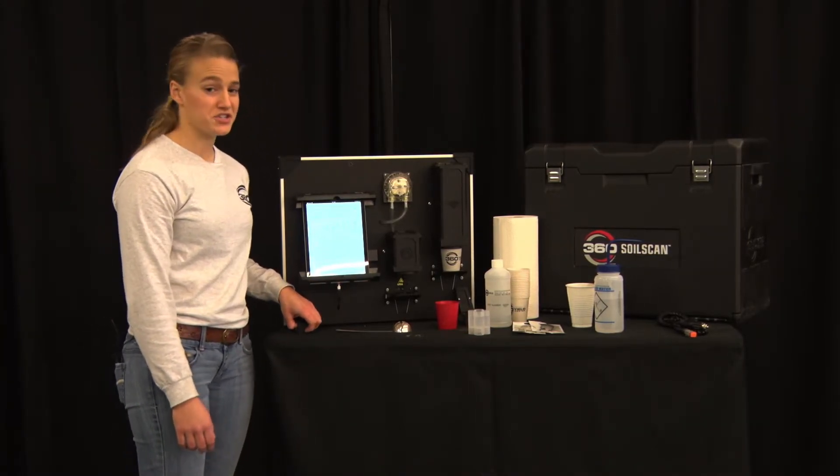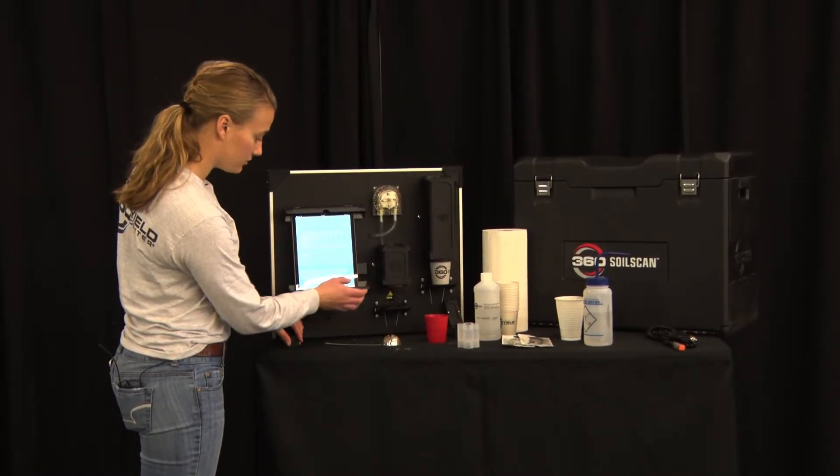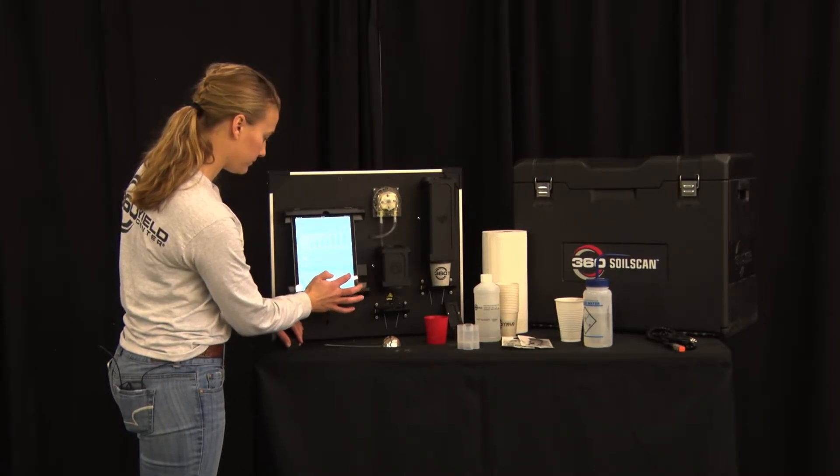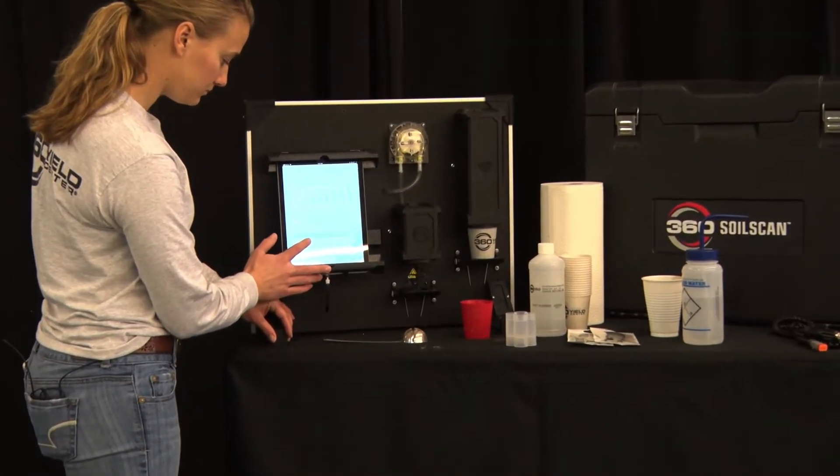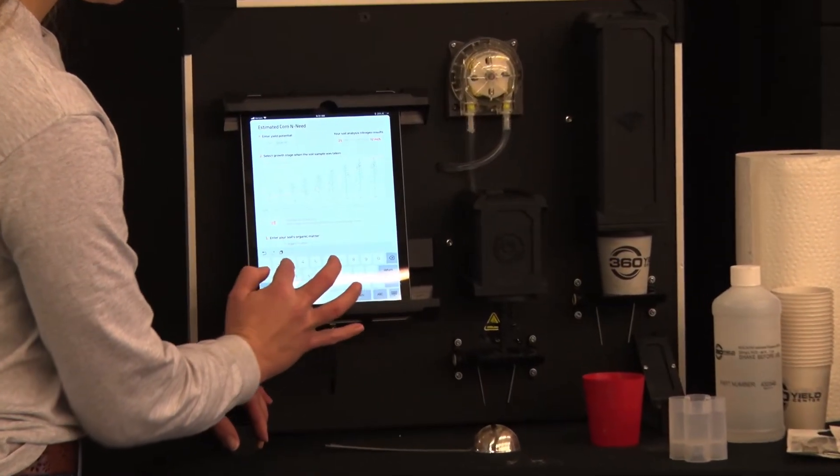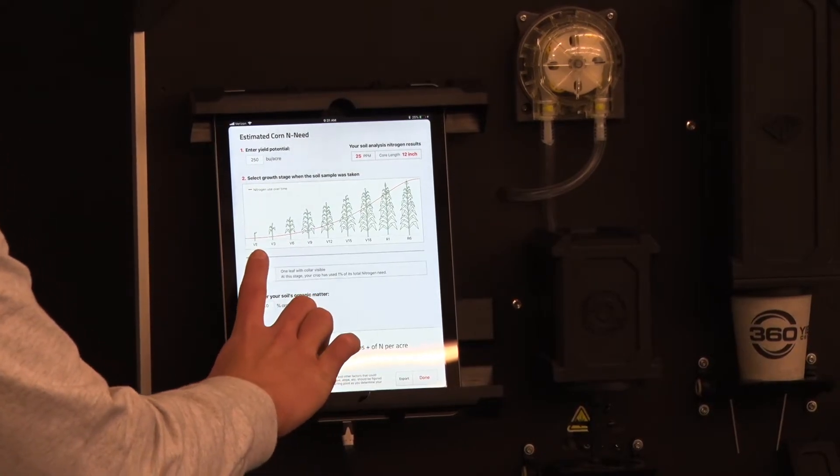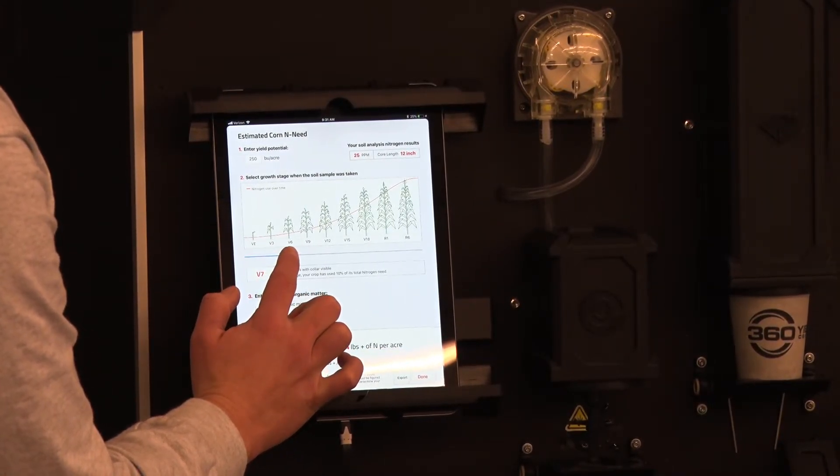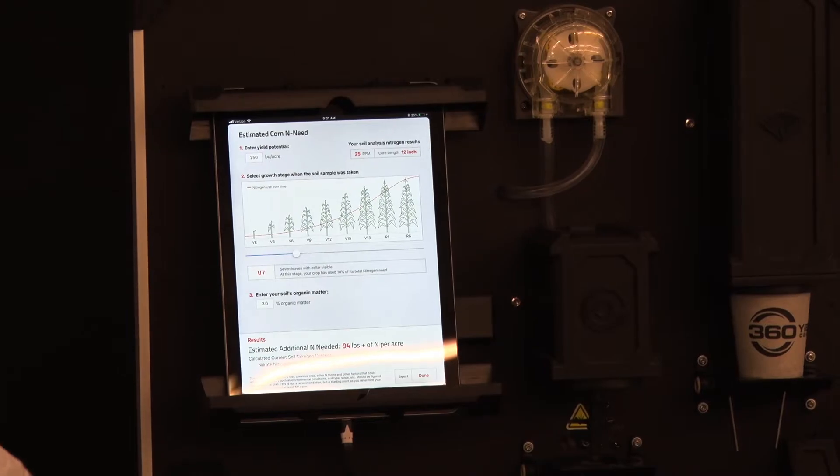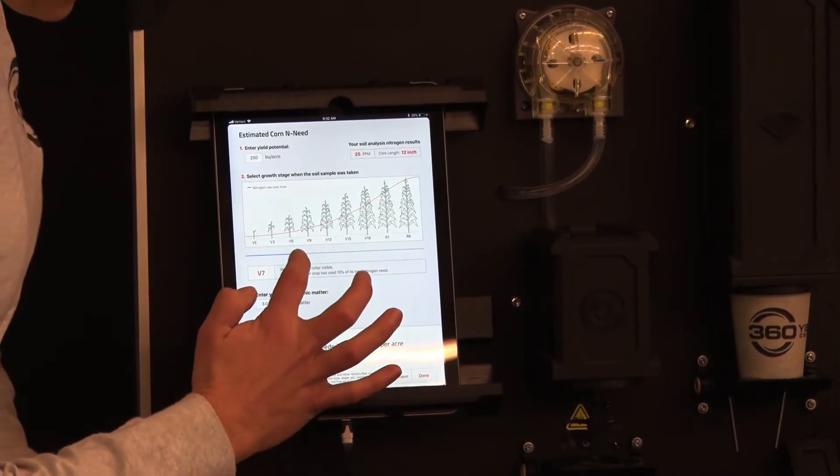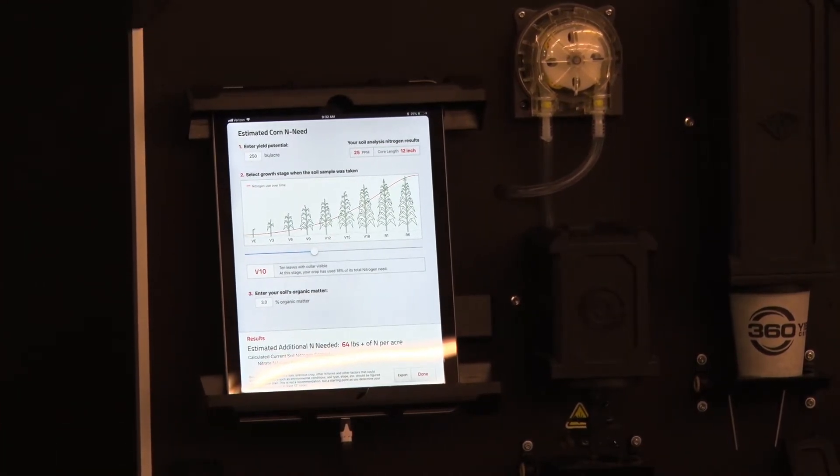Here is where you will estimate the additional n that you will need for your field. So first you're going to enter your yield potential and any organic matter that you have. Then you will select the growth stage from when the sample is taken. If this sample was taken when the corn was at V6 you would need 94 pounds of n per acre. If it was at V9 you would need 64.